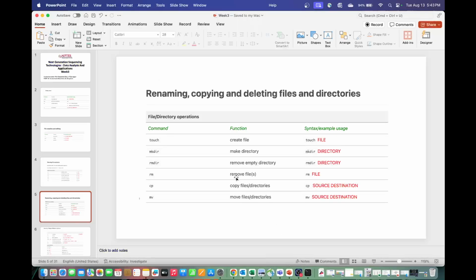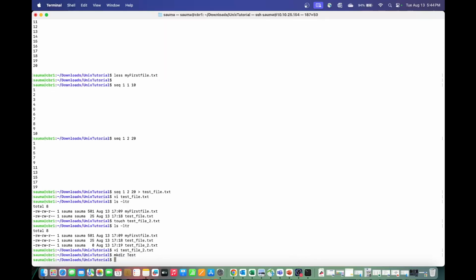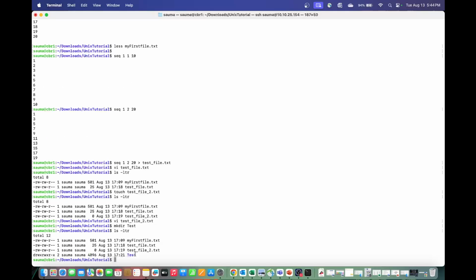So now moving on, mkdir I already showed you. I'll show you another time. So mkdir actually makes the directory. Do mkdir test like this, and it makes a directory. Now check if the directory has been formed. Yes, it has been formed. So mkdir will make the directory.